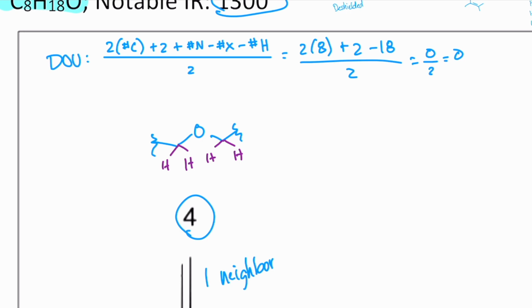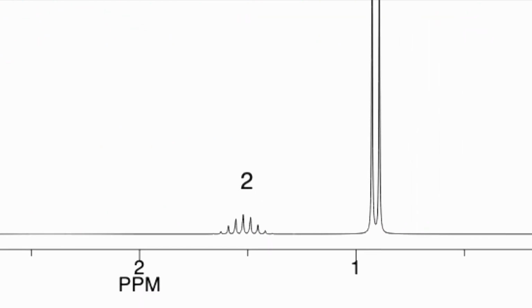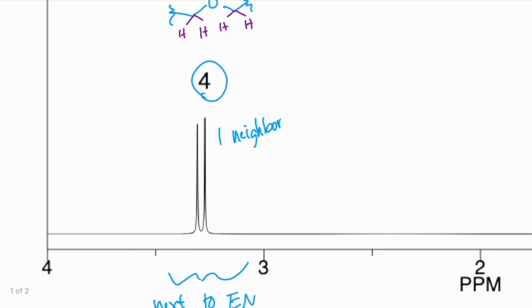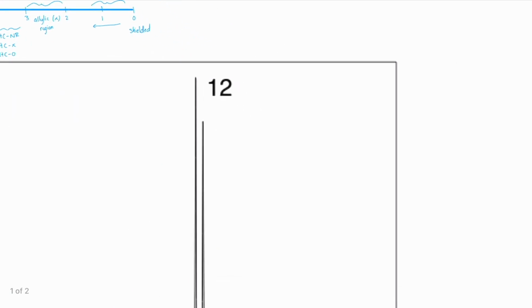Right, we can rotate this molecule around and we get the exact same molecule. And now we just got to figure out what's on the end. So let's look at our other signals. We have a 2 with a multiplet, which sometimes you'll be given that. So this one you'll be given 4 doublet, 2 multiplet, 12 doublet. I didn't give them to you because I made sure my peaks were very, very visible.